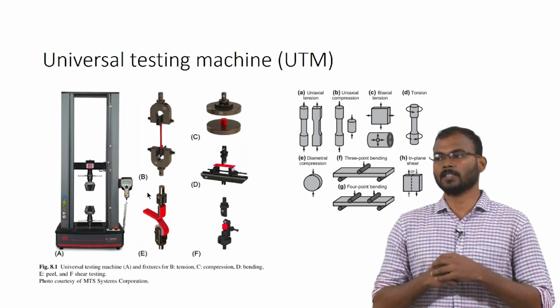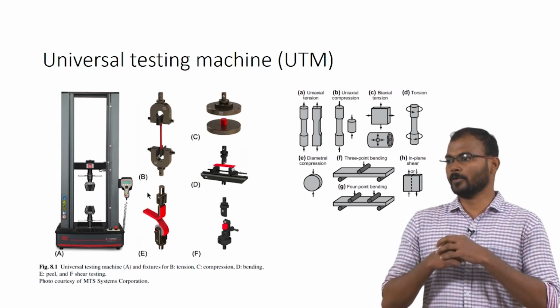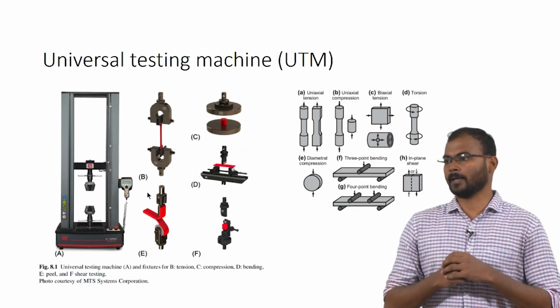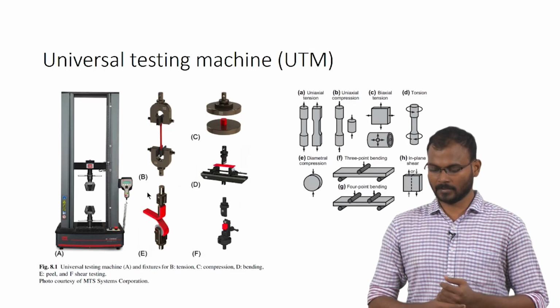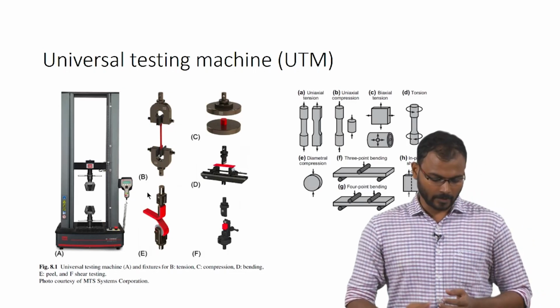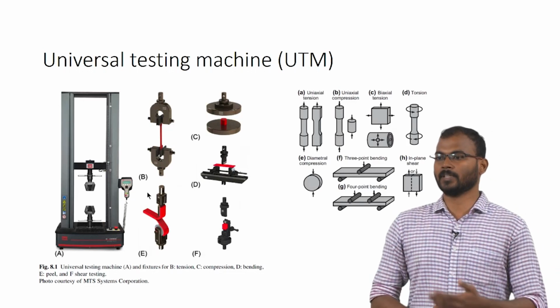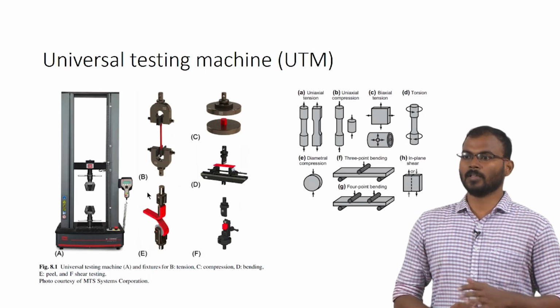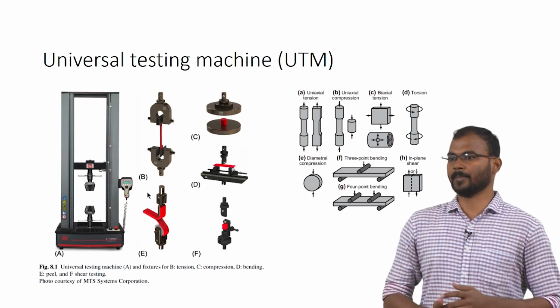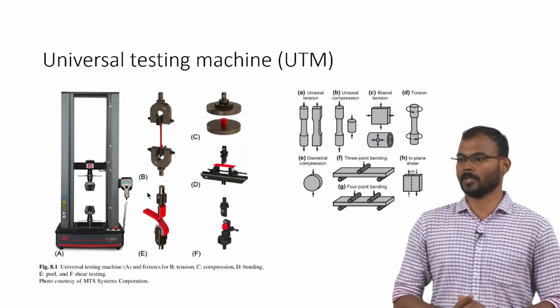There would be a shear stress applied whenever that ball and cup would be moving over that plane. So, that will be found out using the shear stress in-plane testing. All this can be done for different sizes of samples, different sample dimensions, and all the metals, polymers, ceramics and everything. So, using this instrument you can find out all the mechanical properties.